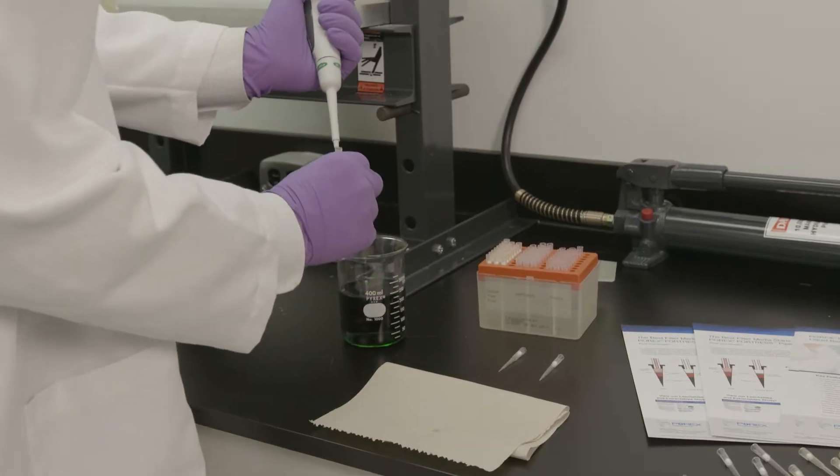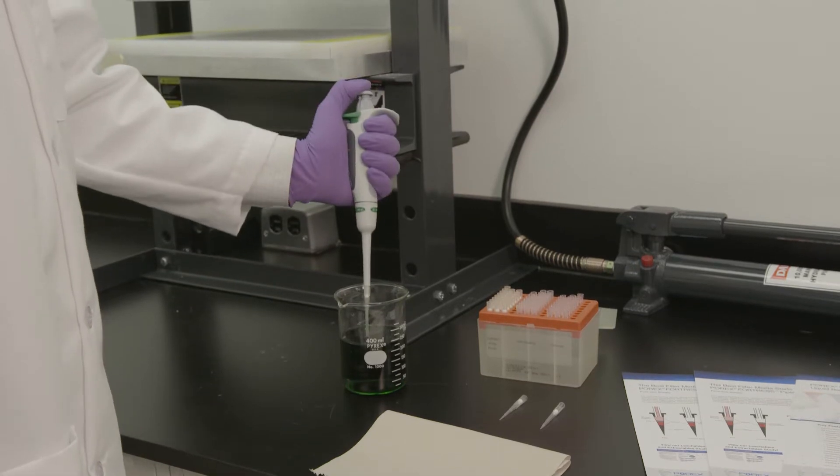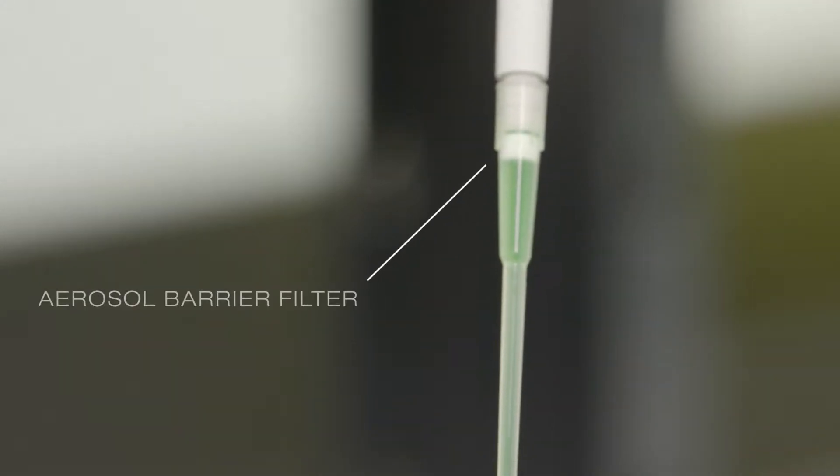Filter A is an aerosol barrier filter set at 200 UL. Watch the sample as we aspirate 300 UL. As you can see, the green sample goes right through the filter.